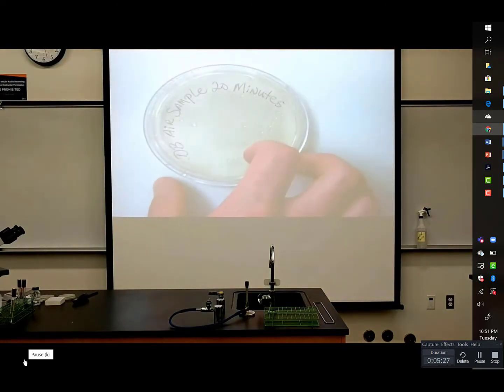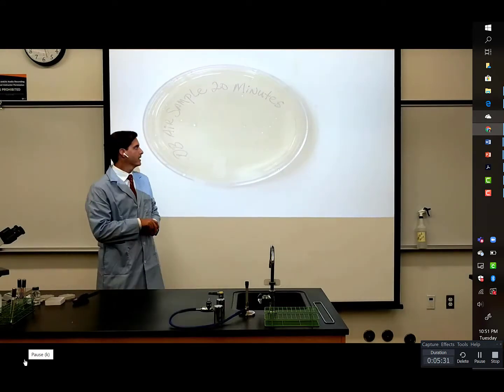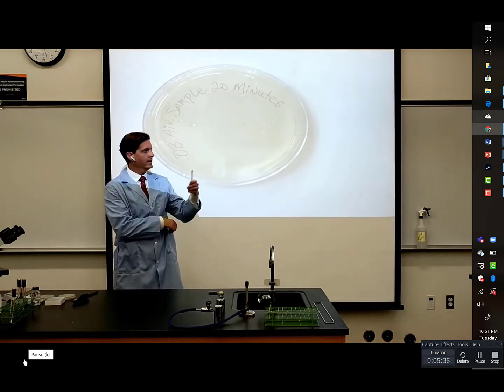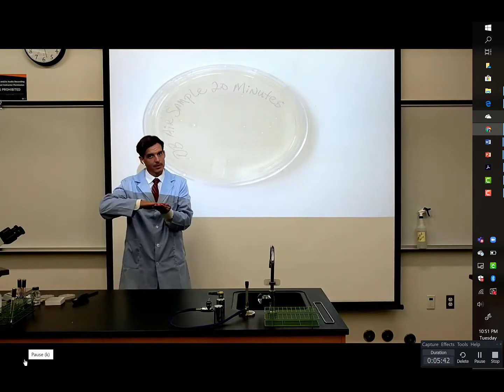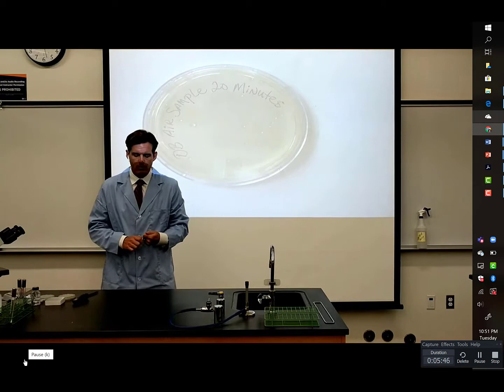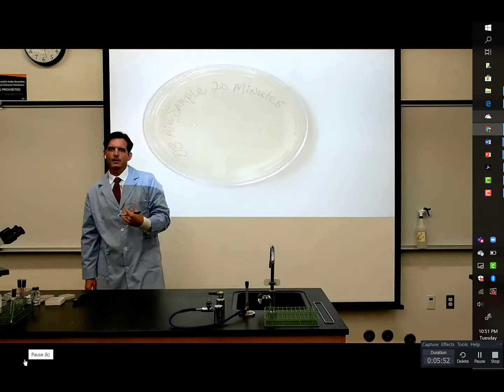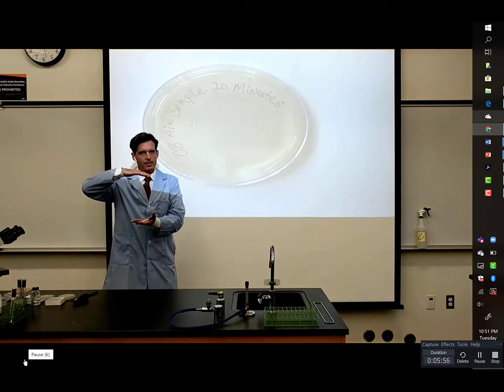Okay. Now, before I open this up and expose it to the air for 20 minutes, let's think about a couple things. Why did we label the bottom of the plate specifically and not the lid? Because most of the time you label the top of something. One reason that we're going to see is that once we take our sample, we're going to be incubating these plates with the lid down and the bottom of the plate up.